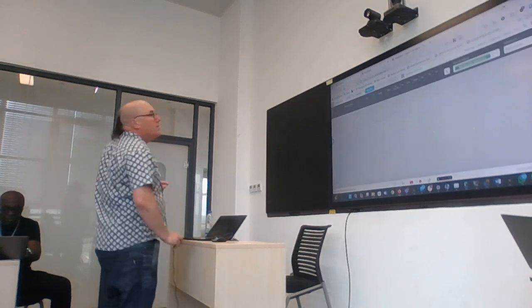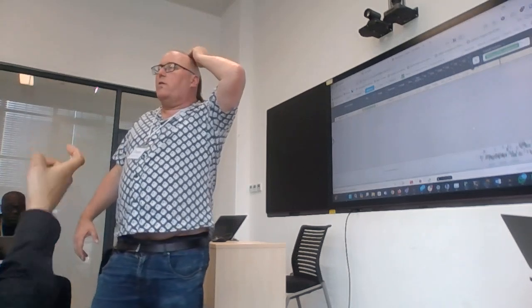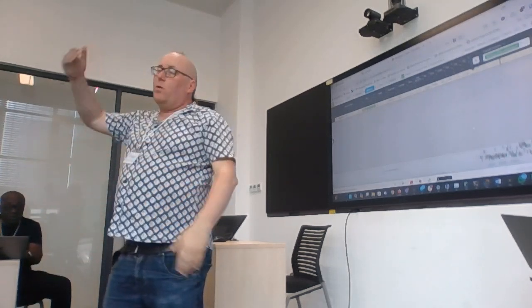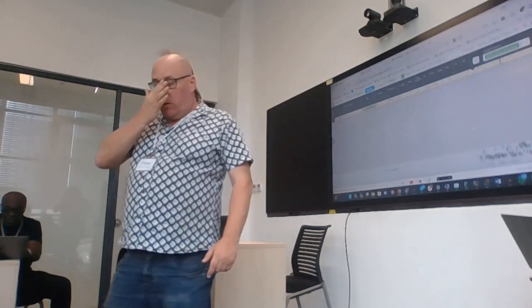Run the analysis. A question: that auto-suggestion, is it fairly accurate? Yes. On average, what the auto-suggestion is doing is it's taking all of the references and lining up your sequences against the references, and it's asking which is the closest. So let's think about when would that not be accurate?